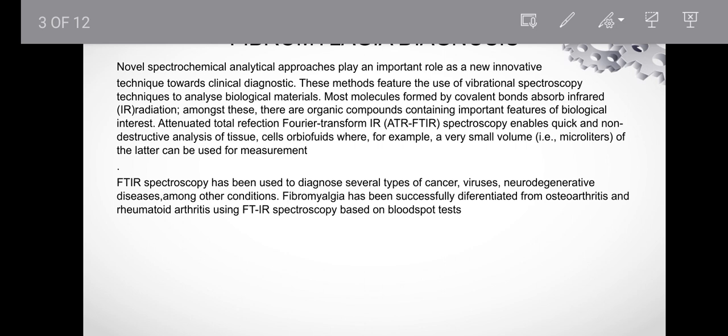The technique using spectroscopy is comparatively simple and cost efficient. These people from Brazil, as you know, Brazil is a very populated country, not as populated as our country, but the case of fibromyalgia is a bit complicated in Brazil. This research study is being conducted by a researchers group from Brazil in collaboration with UK. So we need a cost-friendly, simple, time-saving methodology for diagnosing this fibromyalgia. That is the significance.